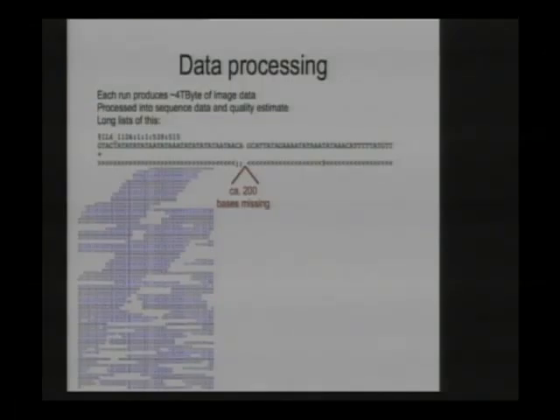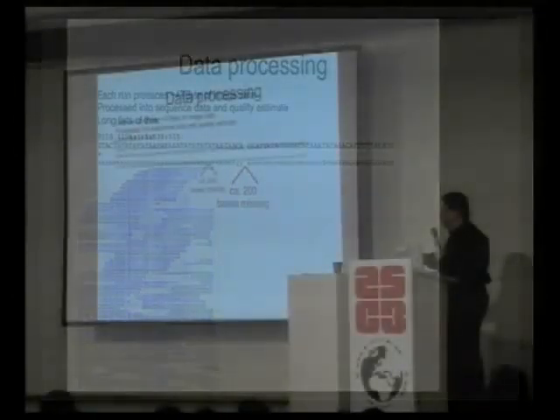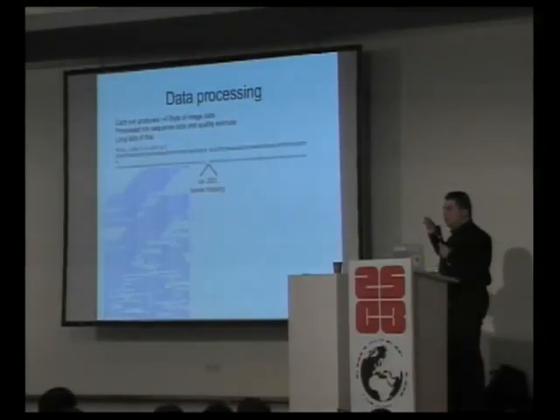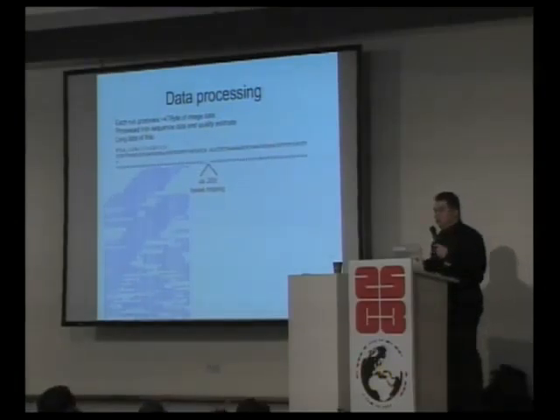And this is what they look like in a so-called alignment. As you can see, the bases in one column are always the same. It's a little hard to see probably. So everything here is a G, and these reads are aligned because there are multiple sequencing strands of the same original molecule. So this base here, for example, has been sequenced, I don't know, 20, 30 times in this process.